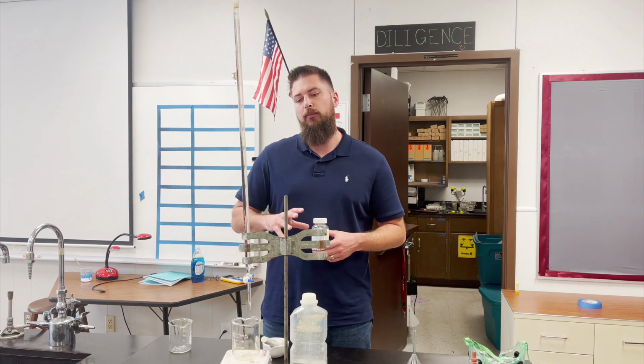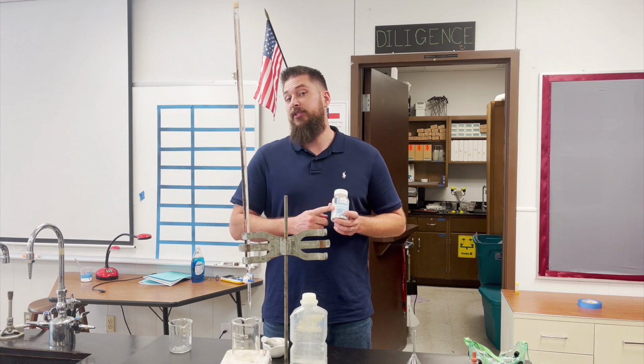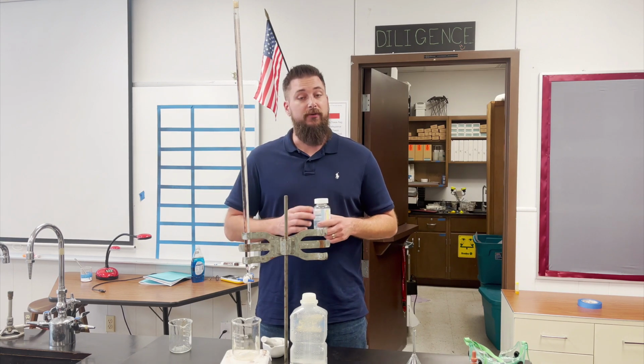So this process of analyzing to make sure that there is inside the pill what it says there is a very important thing.